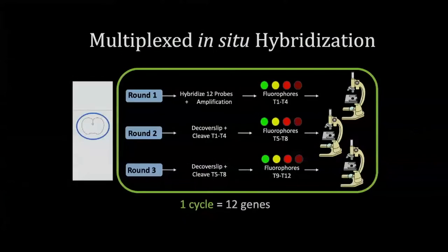So mFISH stands for multiplex fluorescent in situ hybridization. It's a spatial transcriptomic technique that I helped get up and running in the lab. Basically it allows us to fluorescently tag mRNA present in a tissue section with single molecule and single cell resolution.